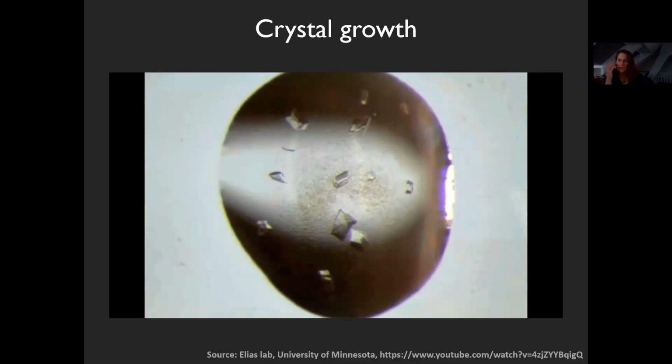Crystals like this, while for a small molecule crystallographer or chemist look terrible and they would throw them away immediately because they have no regular shape, you can see that the edges are rather rugged. As a protein crystallographer, I'm not that strict. My crystals can be ugly and sometimes they diffract nonetheless. So I'll just slap them on the diffractometer, and if they diffract, I'm happy.